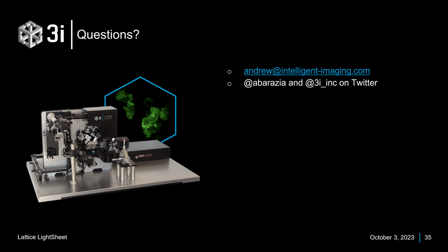So this system has a 405, a 488, a 560, and a 642 laser. It can hold up to 2 more if there's ever interest. We are commonly upgrading with 445s, 515s for CFP-YFP, and then 592 is becoming pretty popular because that hits cherry really well and works a little bit better with 488. But those are the 4 you currently have. If it's a laser in the visible spectrum, it fits the system.